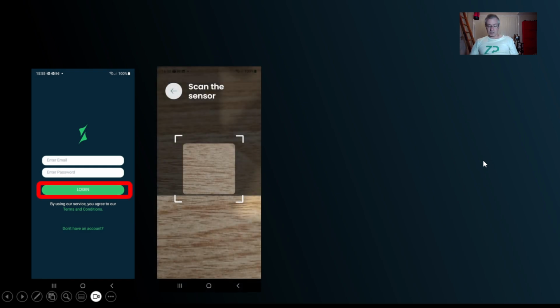When you do log in, it's going to actually try to access the QR reader on your phone. So in fact, I just opened this up now, so there we are. You can see that it's got the QR reader. I'll just do square wave voltammetry again. Yeah. So now I can actually do square wave voltammetry.